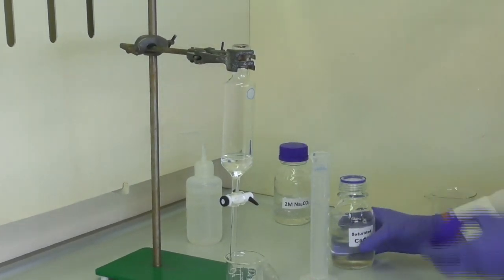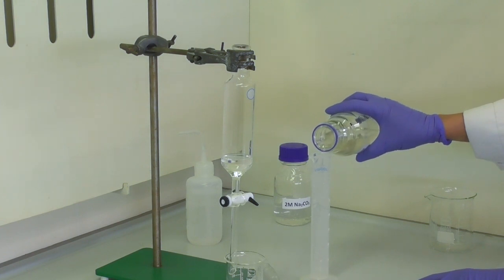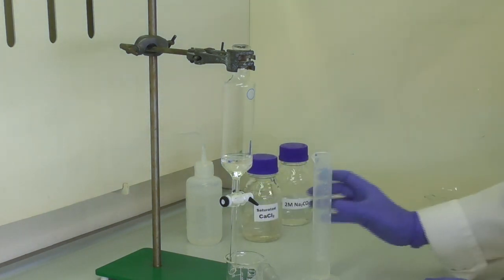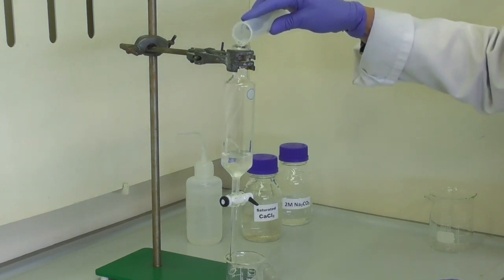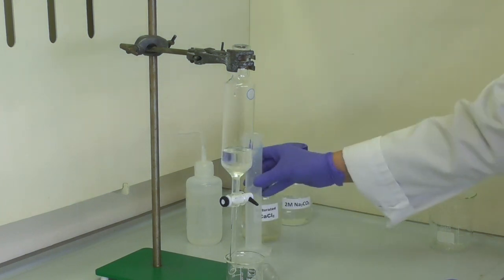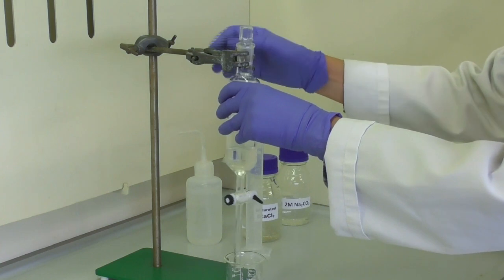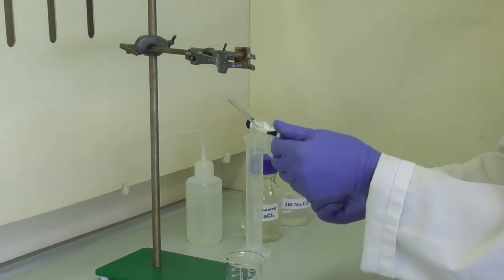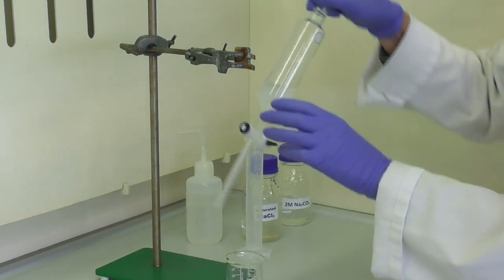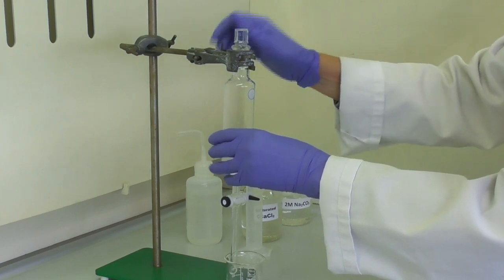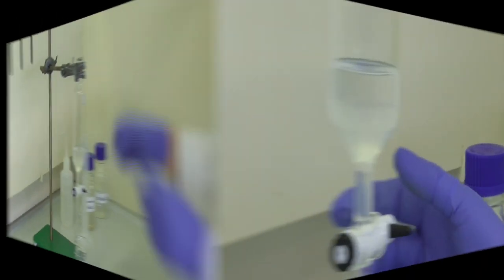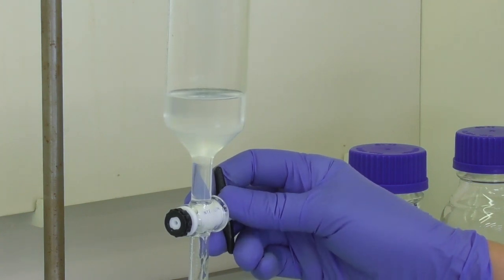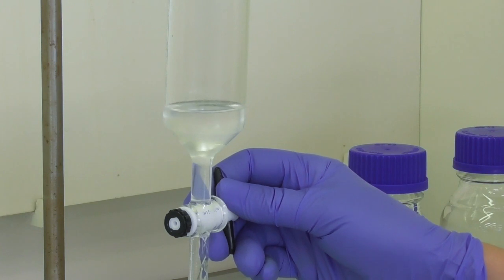After draining the aqueous layer, we add the third reagent, which is calcium chloride solution. This is a drying agent, so it will draw some water out of our organic layer. We add this into the funnel and repeat the shaking process, then drain the aqueous layer.